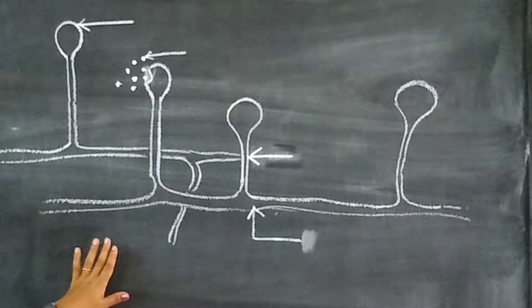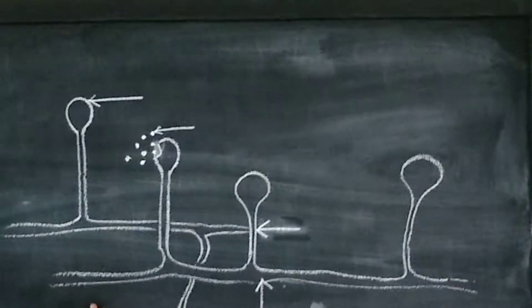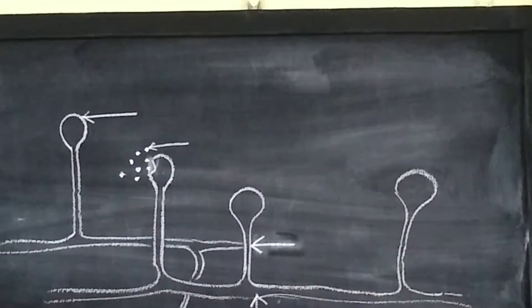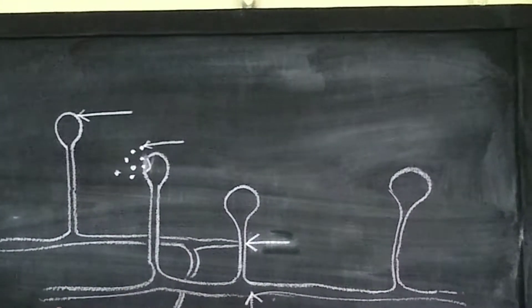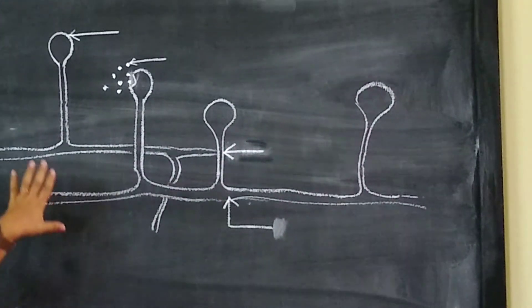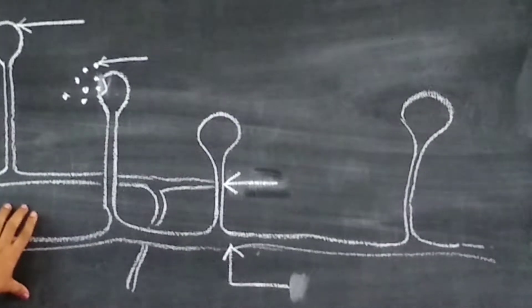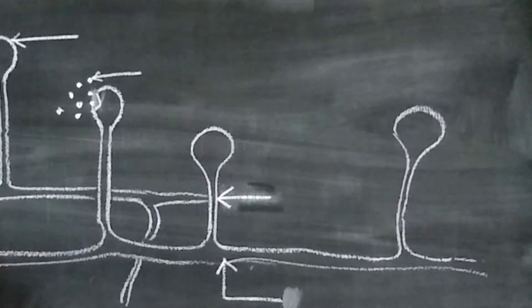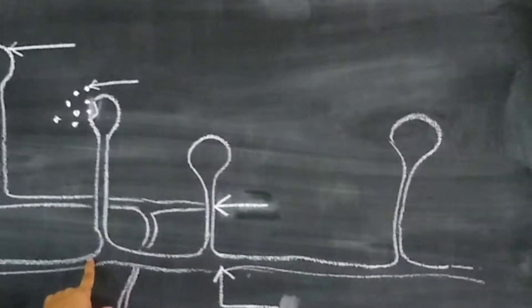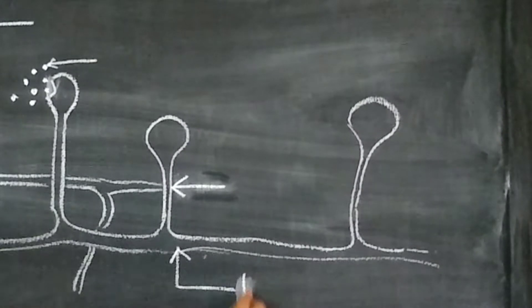When you observe bread mold under the microscope, we observe this. So this is the picture of bread mold. The fine threads that you see are the hyphae.